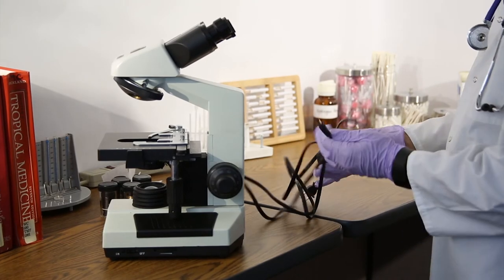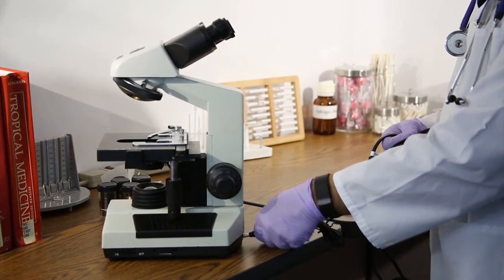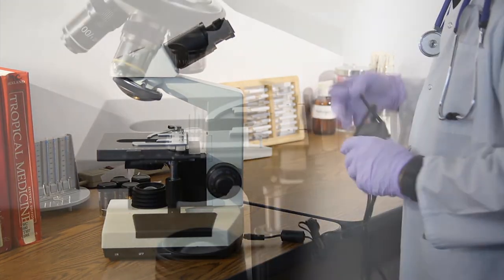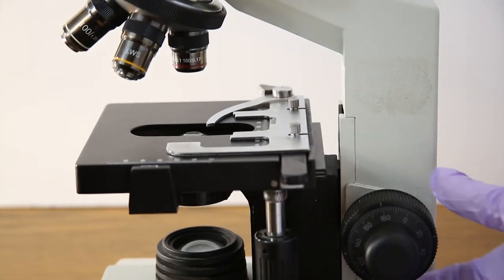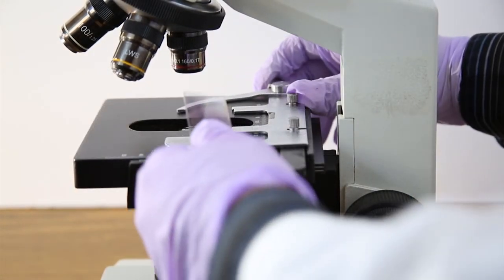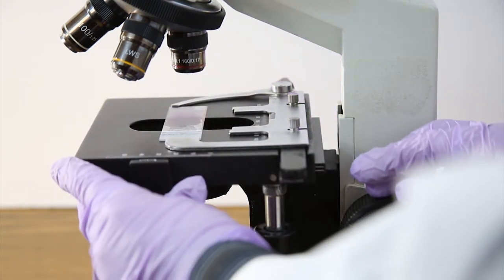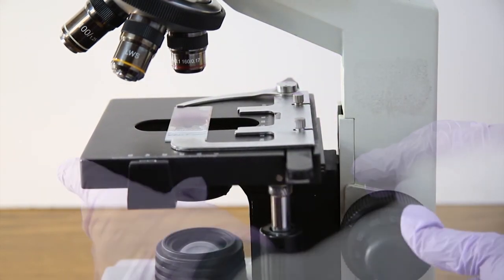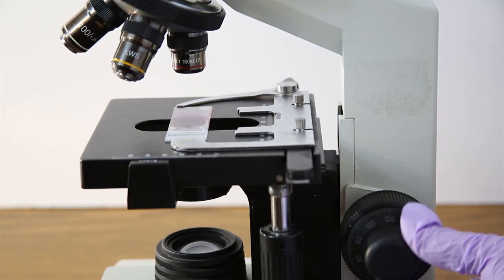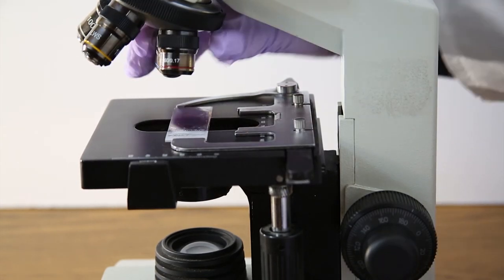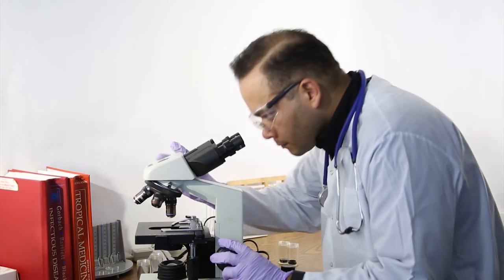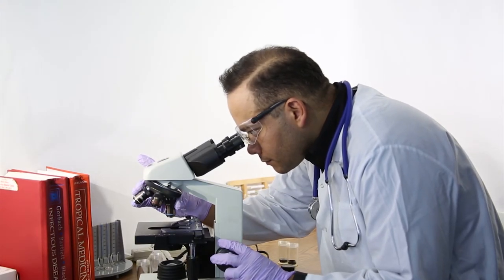To operate, plug the AC power cord into the appropriate grounded AC outlet and into the back of the microscope. Rack the condenser down, place a slide onto the stage and raise using the large knob until just below the lens. Adjust focus with the fine adjustment which is the smaller knob. Once the slide is in focus, you may use the other lenses with higher or lesser power and adjust accordingly.